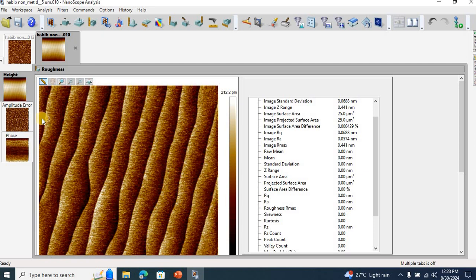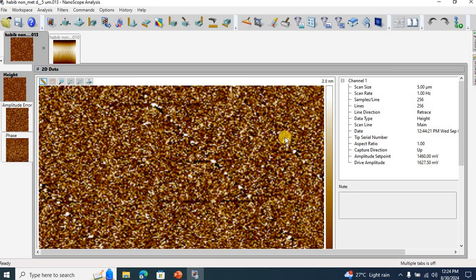And also this kind of stepped surface morphology, it's called terracing step structure. So this kind of terracing step structure results in better growth of the following layers on top of the sapphire substrate. So we mostly grow aluminum nitride, gallium nitride, these kind of materials on top of sapphire substrate, and this kind of surface actually gives better results as compared to this kind of surface.